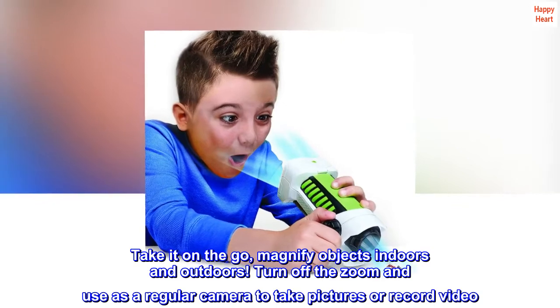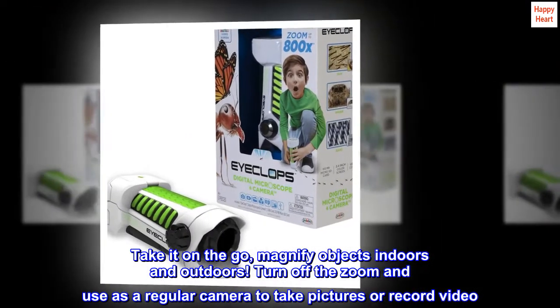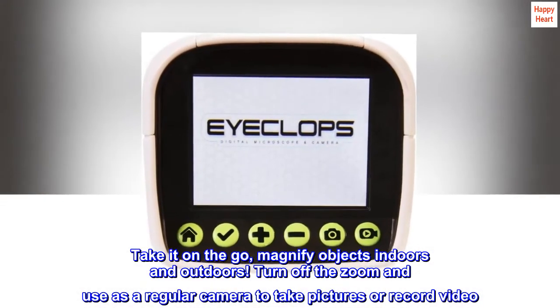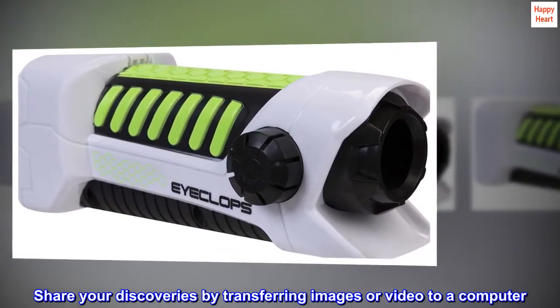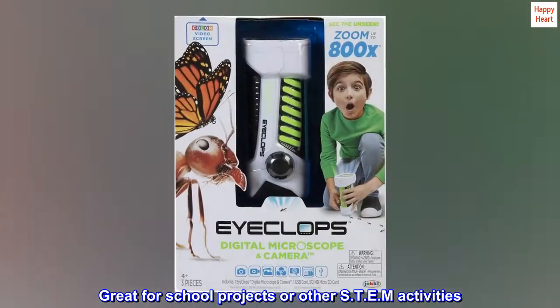Take it on the go — magnify objects indoors and outdoors. Turn off the zoom and use it as a regular camera to take pictures or record video. Share your discoveries by transferring images or video to a computer. Great for school projects or other STEM activities.